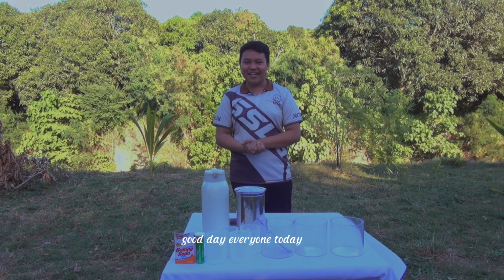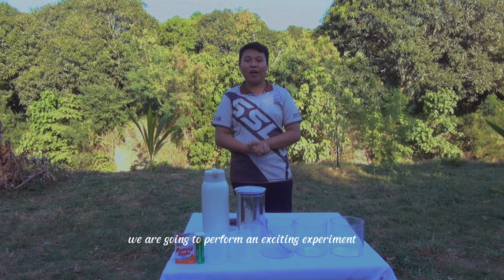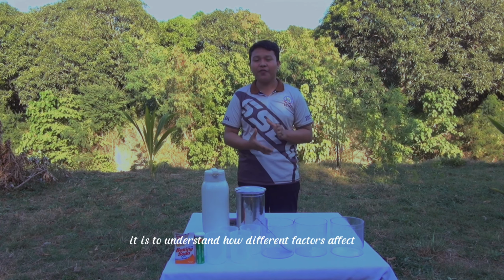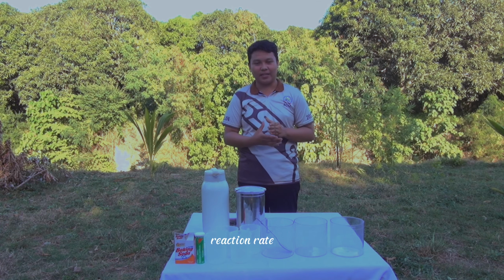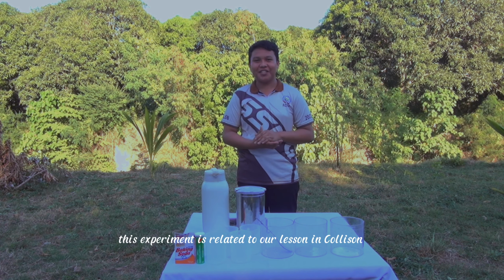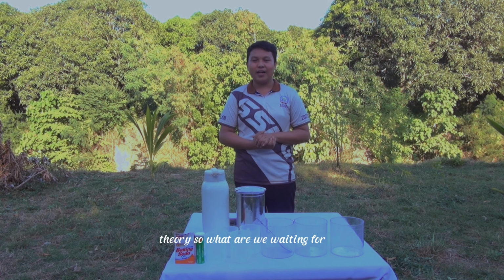Good day, everyone! Today, we are going to perform an exciting experiment in physical science. It is to understand how different factors affect the reaction rate. This experiment is related to our lesson in collision theory. So what are we waiting for?